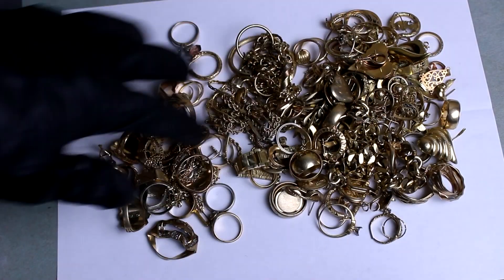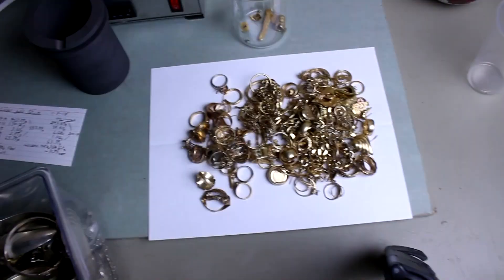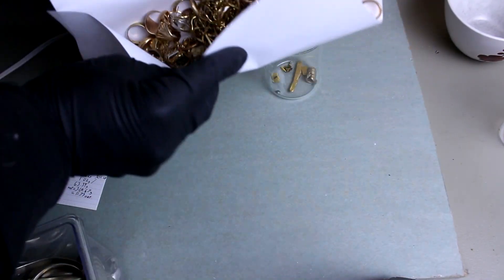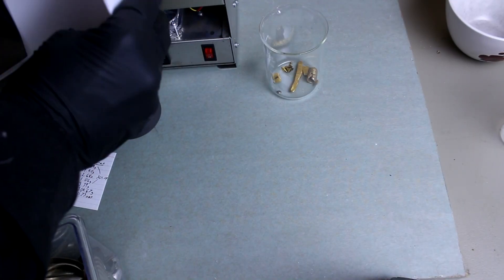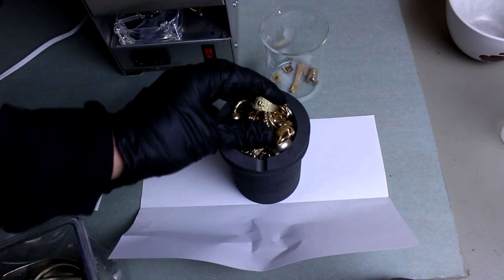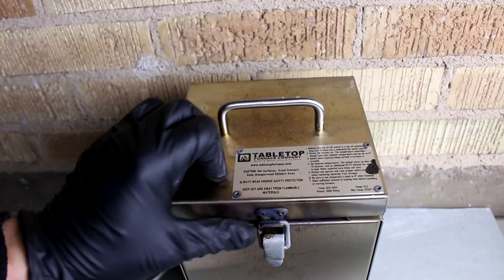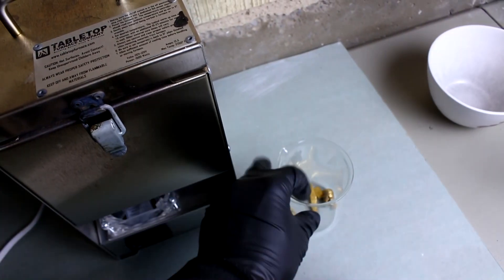Let's get one last good look at all the jewelry I'm about to destroy. It barely fit, and there it goes — that's melting. Let's go get this dissolving.